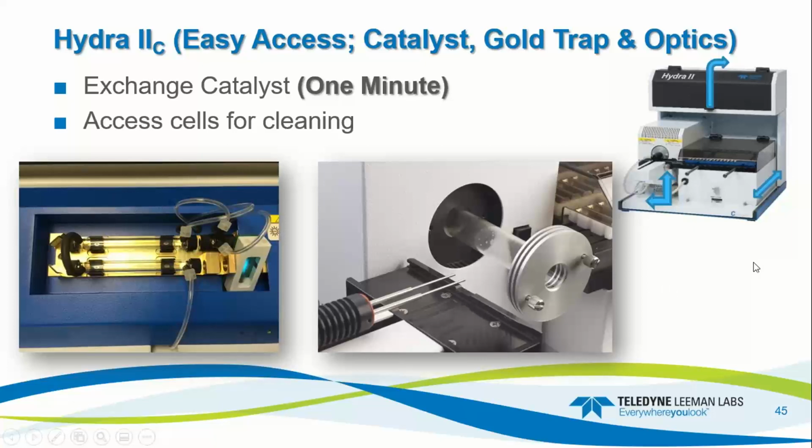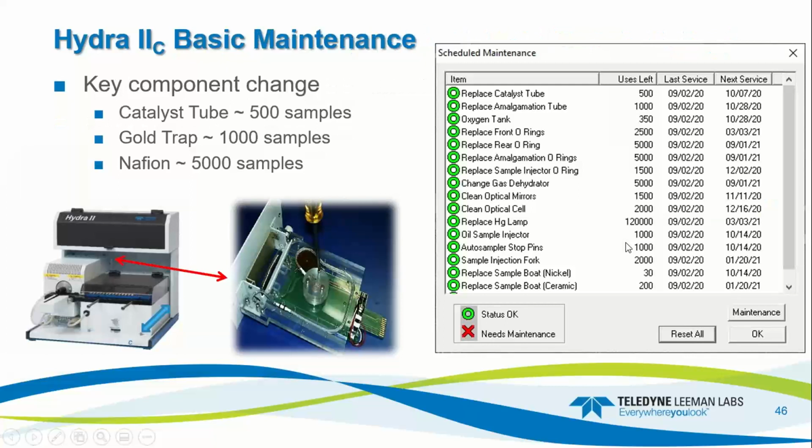If it's cool or hot, I've taken them out hot and put them on a surface that can handle the temperature, wearing gloves that can handle the temperature as well, so you don't burn your hands. And then working with the cells in the spectrometer is pretty easy. Another door, you just flip it up, and then you have access to those cells.